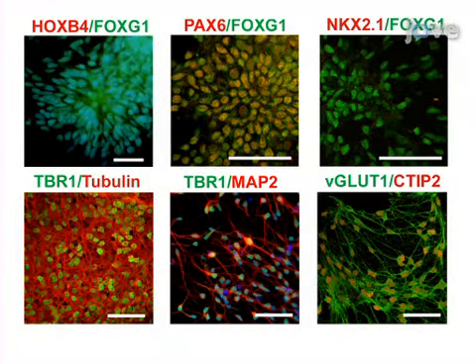Ultimately, results can be obtained that show the specific types of neurons formed through immunostaining or electrophysiology. The implications of this technique extend towards a wide variety of genetically inherited diseases, because patient-specific neurons can also be generated from induced pluripotent stem cells, where the mechanism of action as well as potential therapies can be elucidated. Though this method can provide insight into the development of telencephalic neuronal subtypes from pluripotent stem cells, it can also be applied to other systems, such as human diseases related to telencephalic neurons.